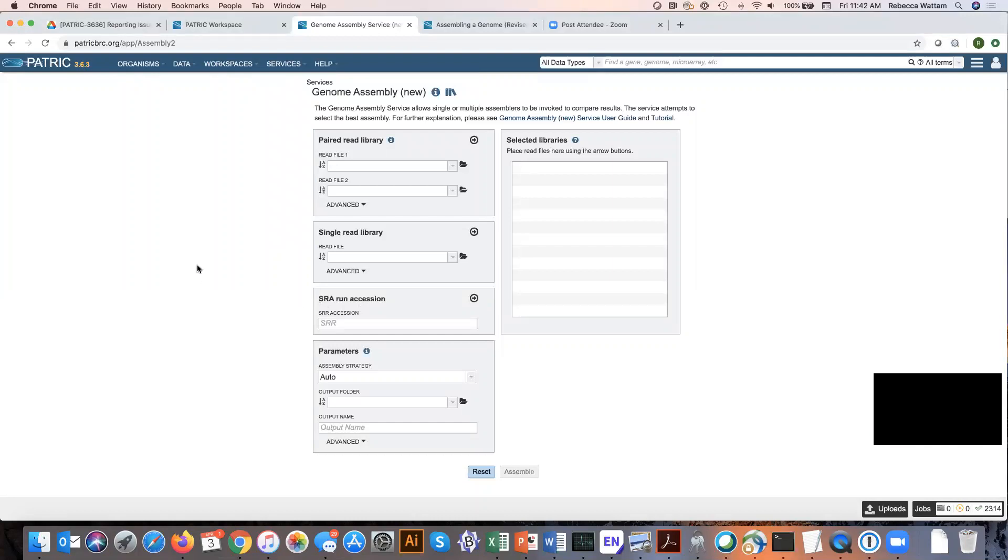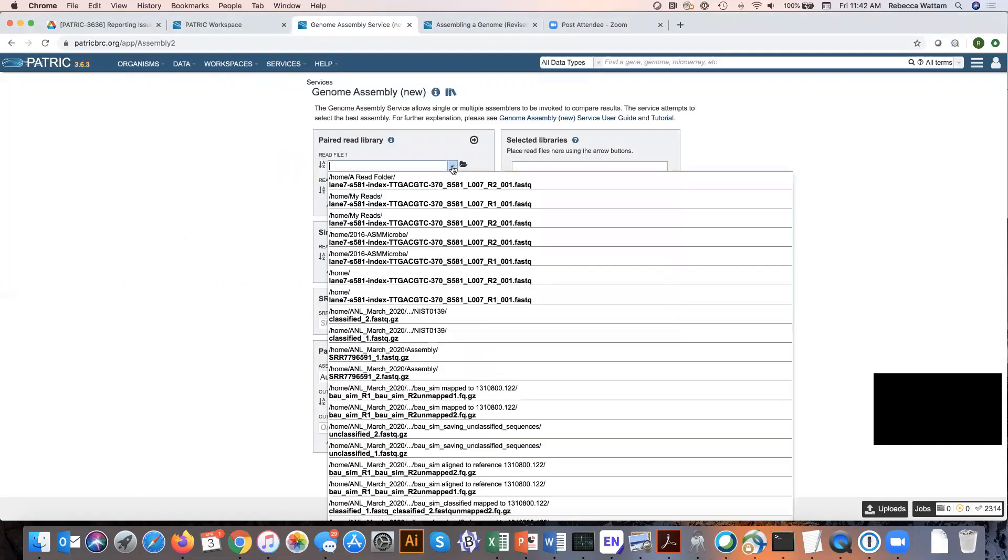Let's talk a little bit about paired reads. If you've recently uploaded data into Patrick, you could click on this down arrow here and it would show you the most recently loaded data that you put in.